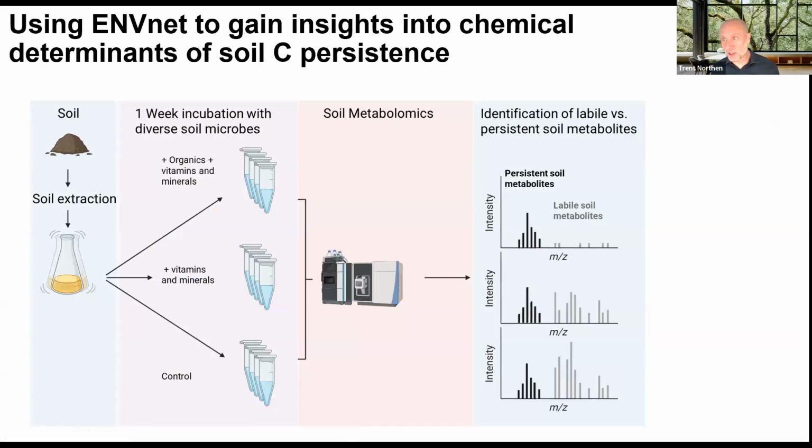And so we had this fun idea to come back to the question: does the structure of molecules actually have anything to do with their persistence? And so we designed this experiment. This is the work of Marcus de Rod, where we took soil and extracted the organic matter with water. So this is dissolved organic matter. And then we incubated it with microbes from the soil too. So we extracted the microbes and we added them.